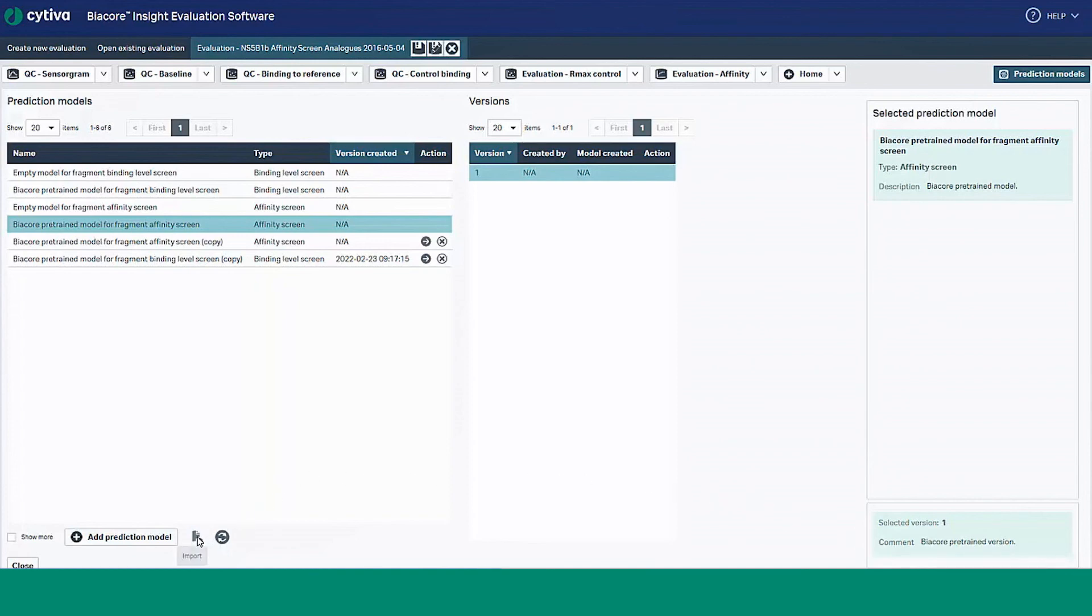You can import or export prediction models to share models between groups and collaborators, helping to standardize your analysis projects and programs. You can also remove models here as needed.